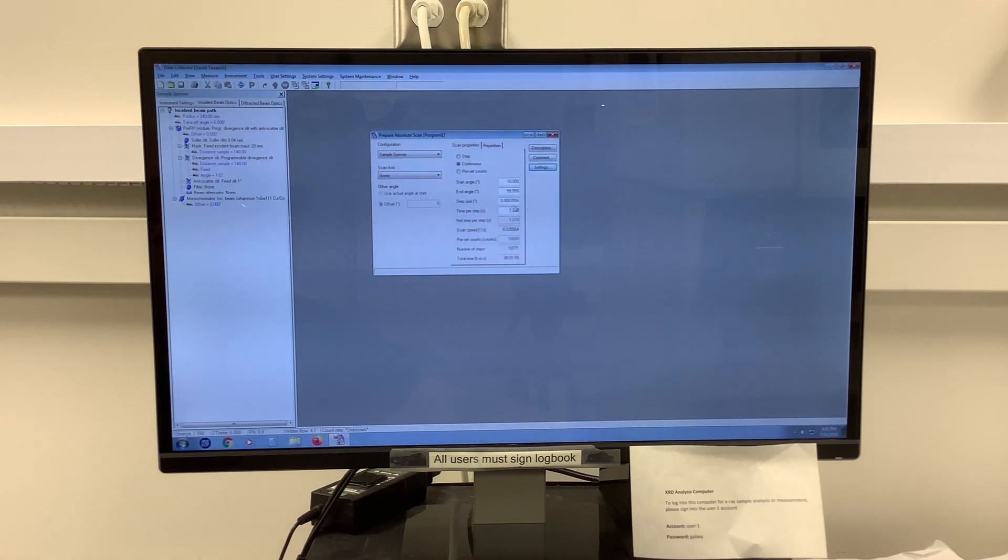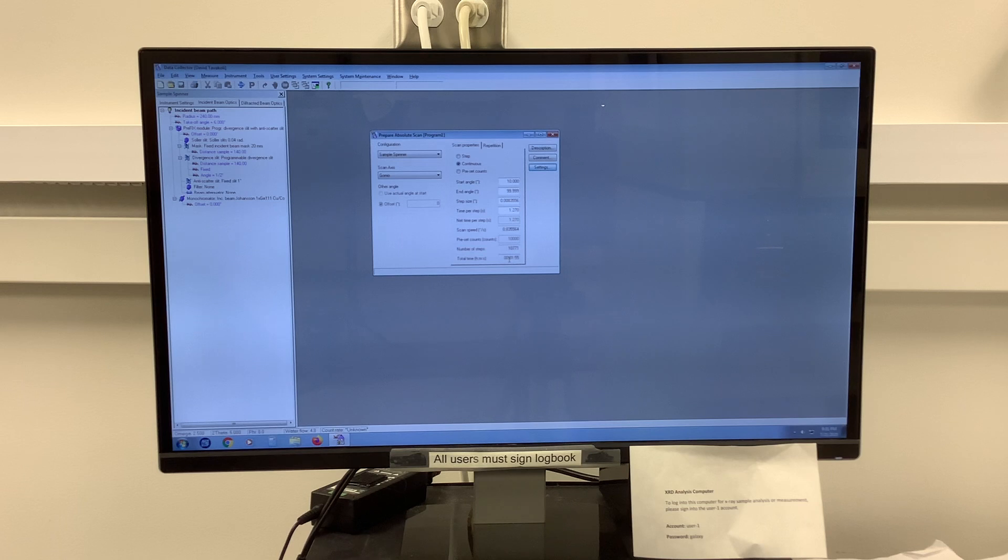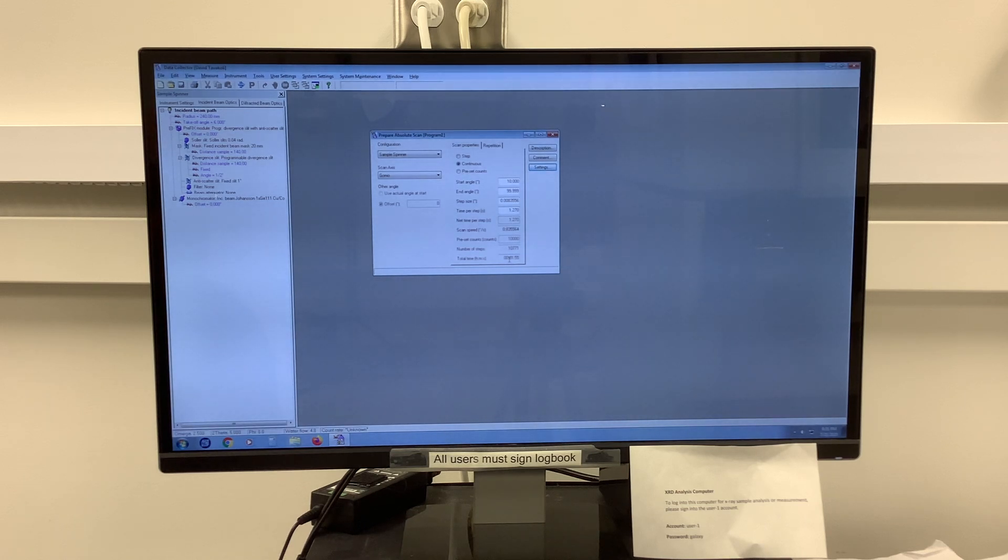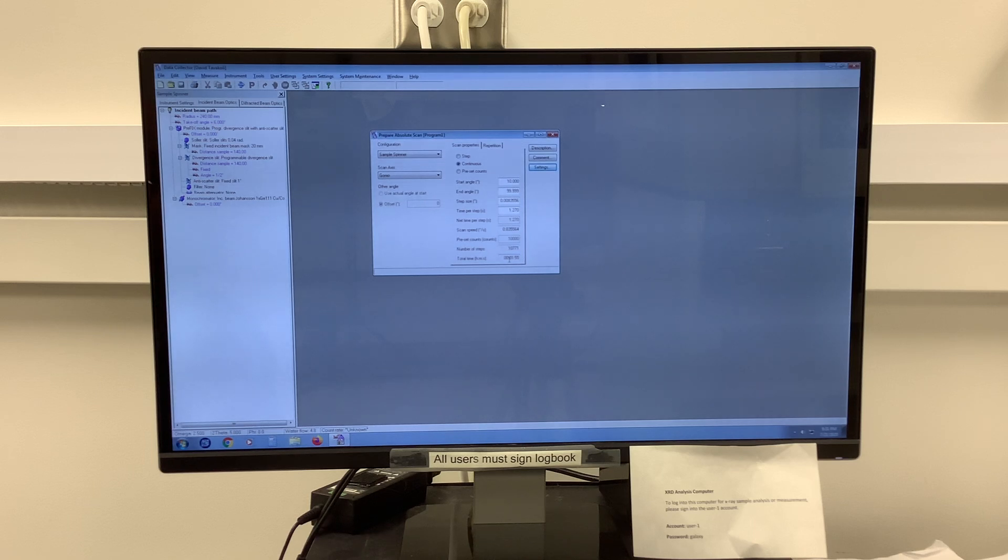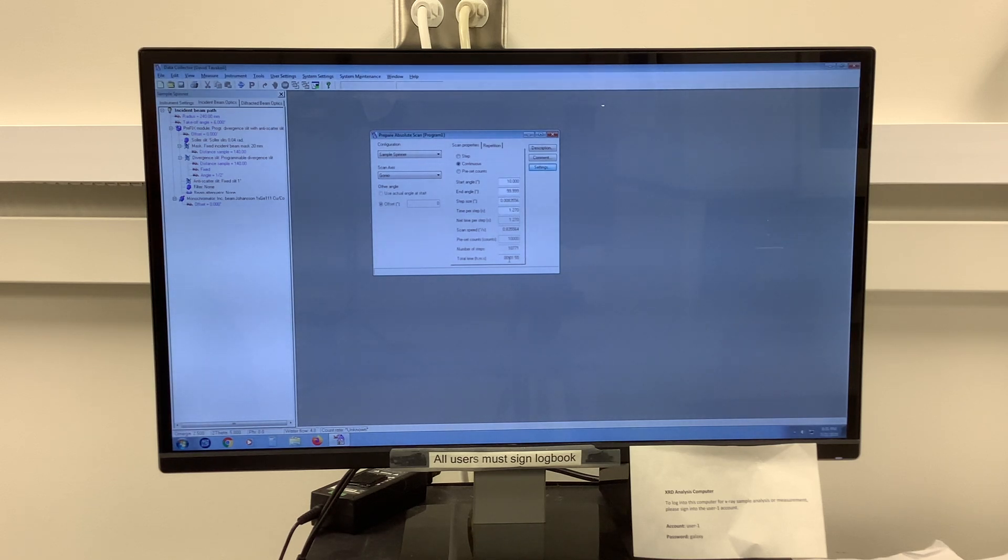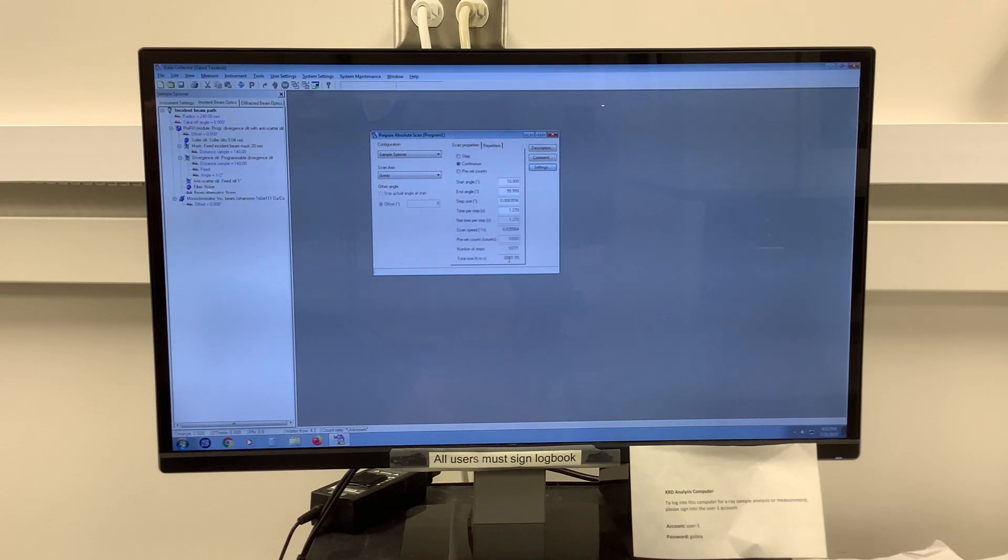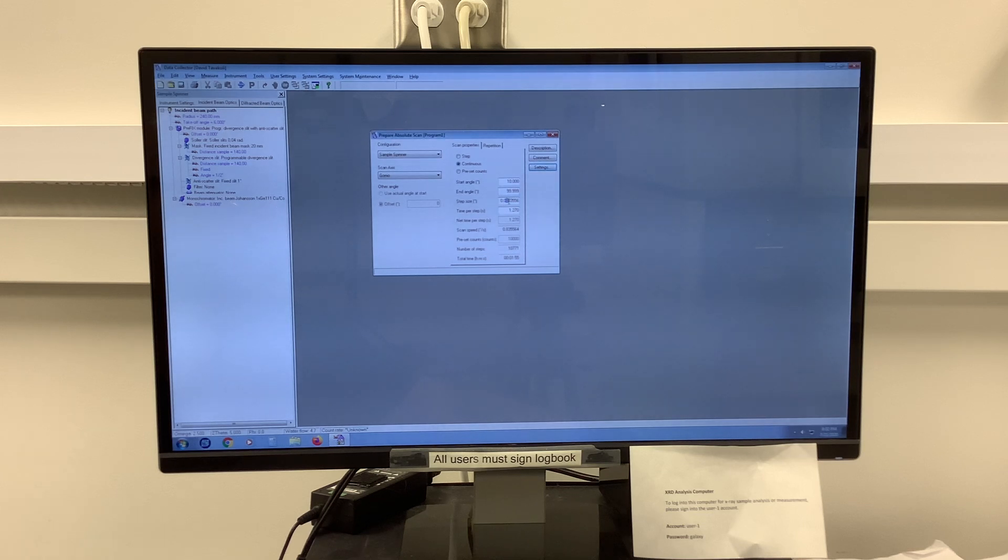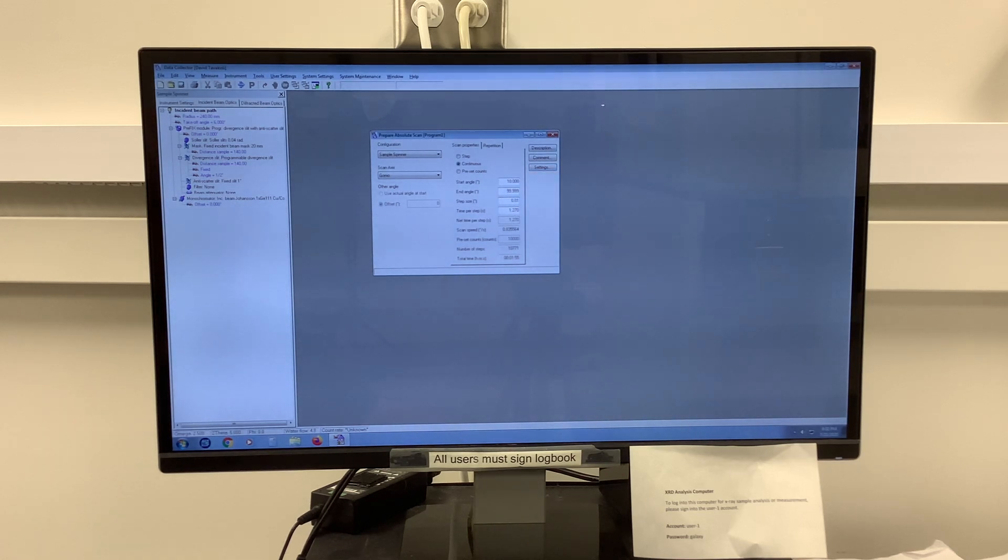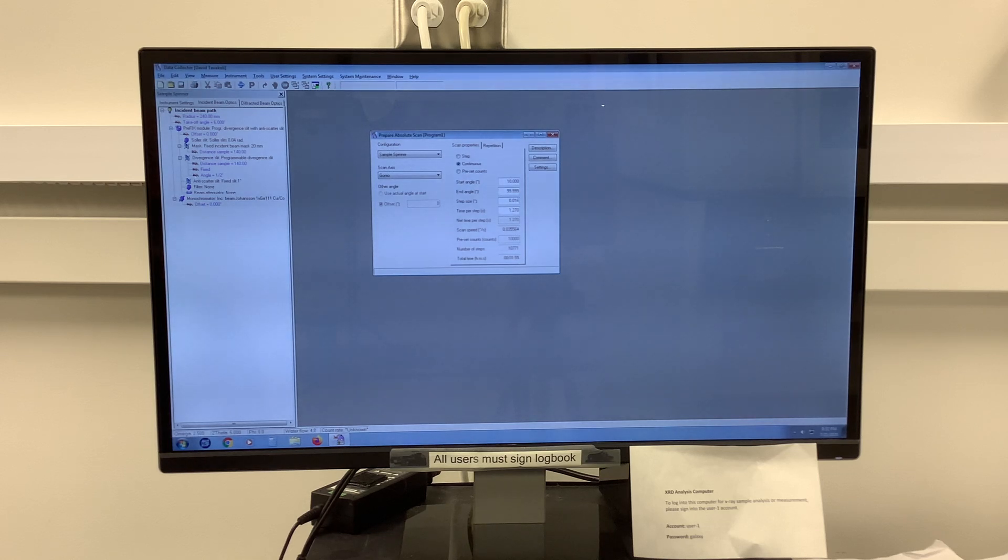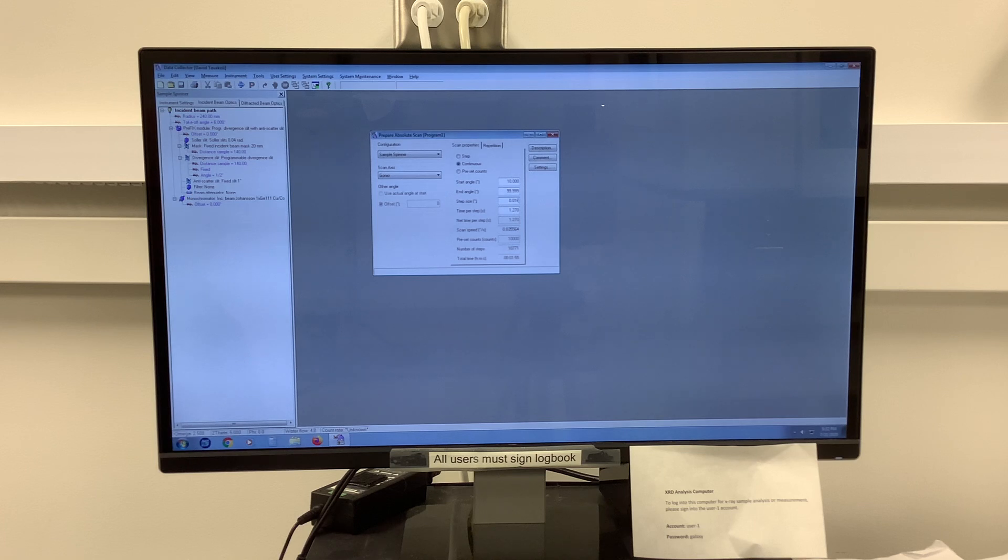Now you notice my total time has gone from an hour and 15 minutes to now a minute and 55 seconds. For me, that's a little too fast a collection time. I'm going to change two other parameters here as well. My step size is a little too fine. For most materials, a step size of 0.016 degrees is perfectly good and will give you the resolution you need for most materials.